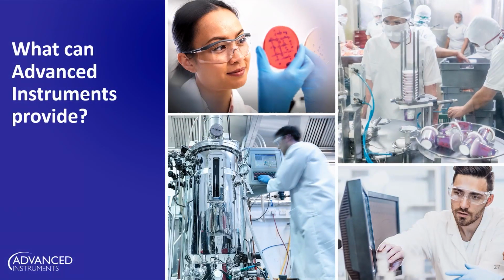And with that, that concludes the run-through of osmolality applications within the cell and gene therapy workflow. I hope I was able to increase your understanding of osmolality within the more commonly known use cases, as well as bringing to your attention some potentially newer ones. We can now look specifically at what advanced instruments can provide to help.